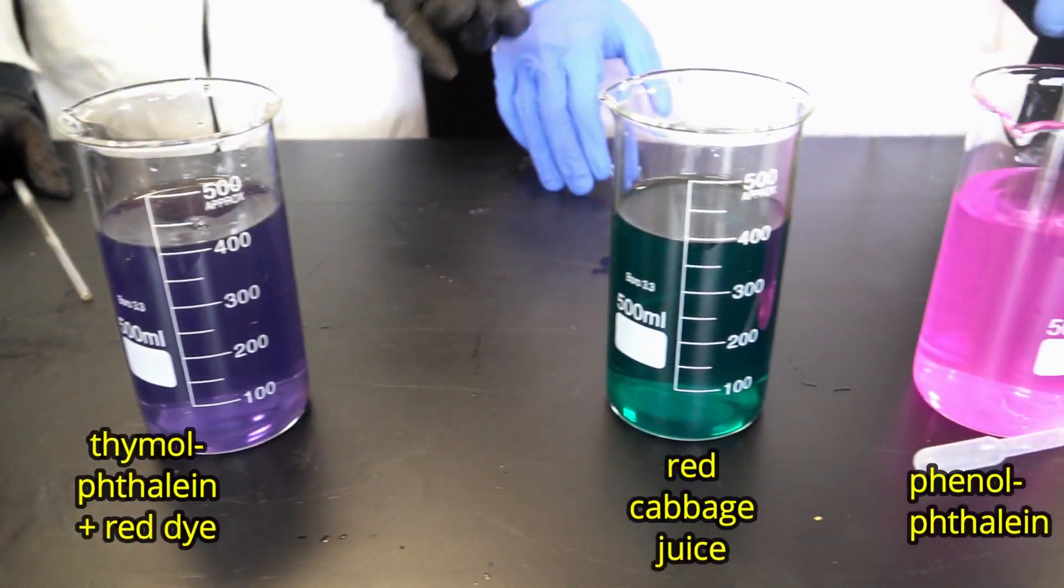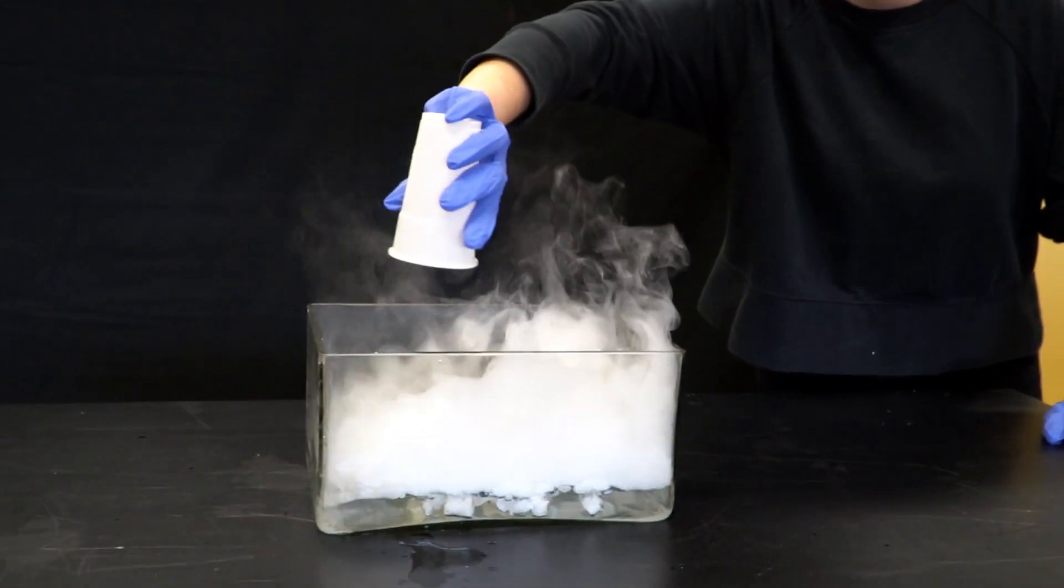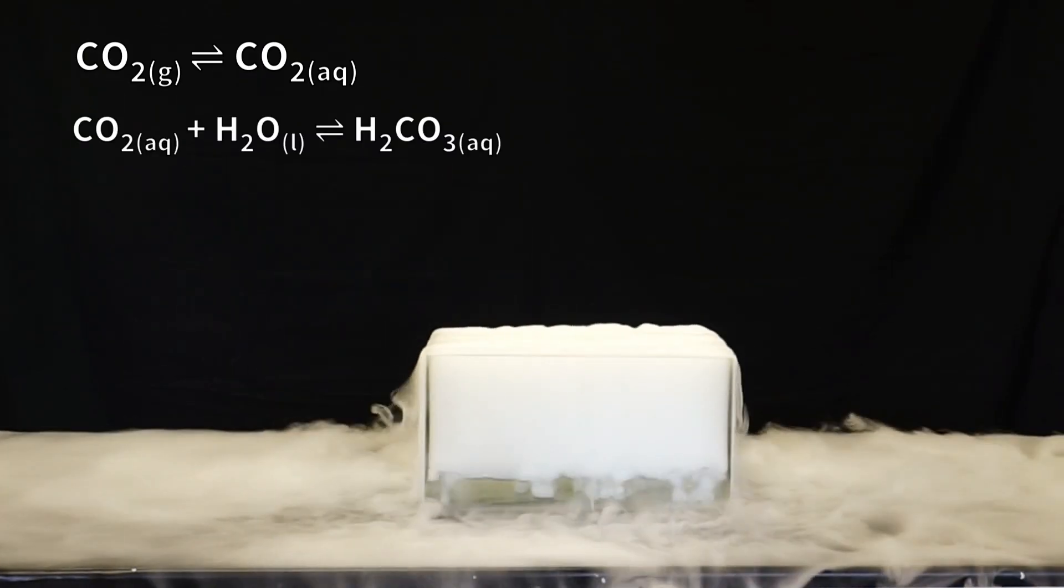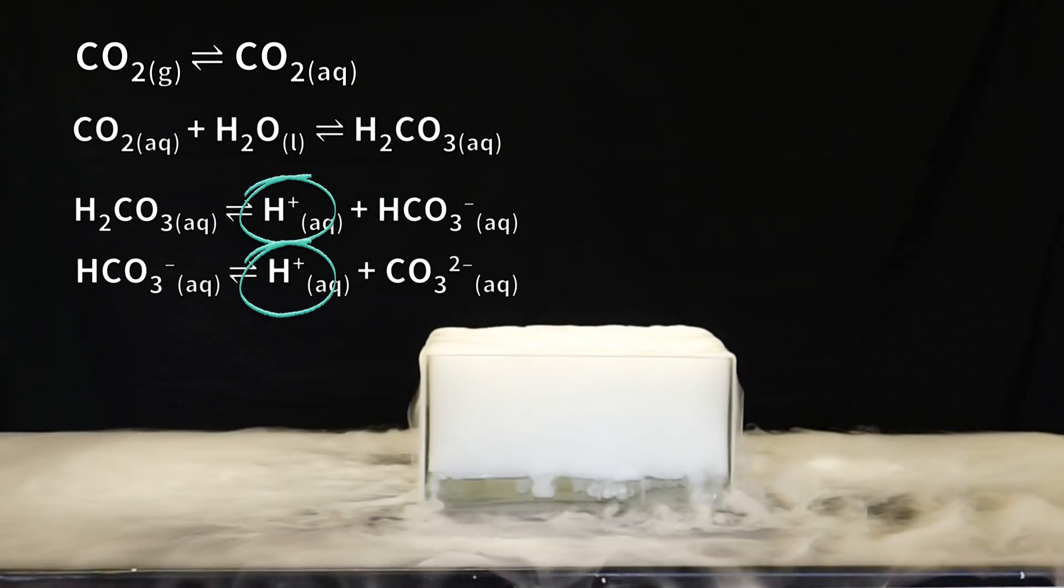To achieve gradual decrease of pH we used dry ice. When added in water some carbon dioxide dissolves in it and produces carbonic acid which in turn releases protons and leads to slow decrease of pH.